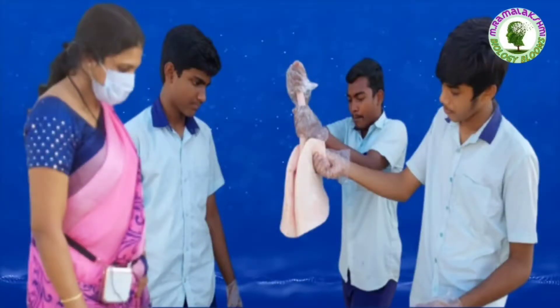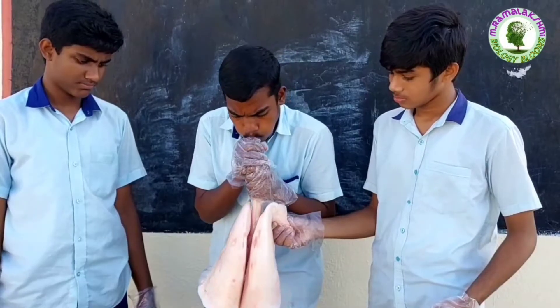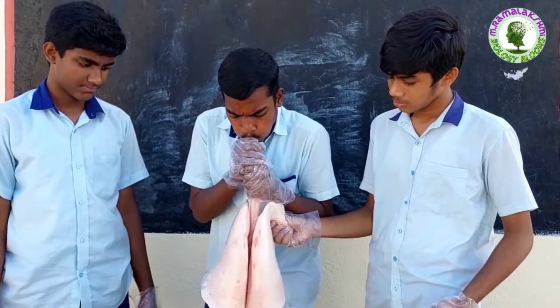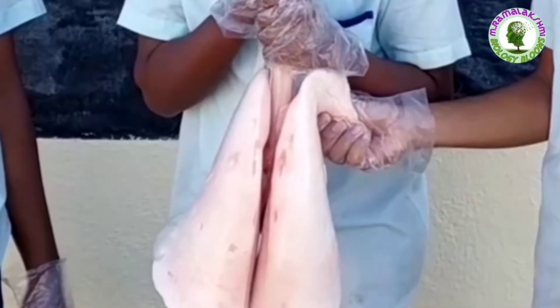Now let us observe this system with the help of goat lungs. Now observe inhalation and exhalation in goat lungs.